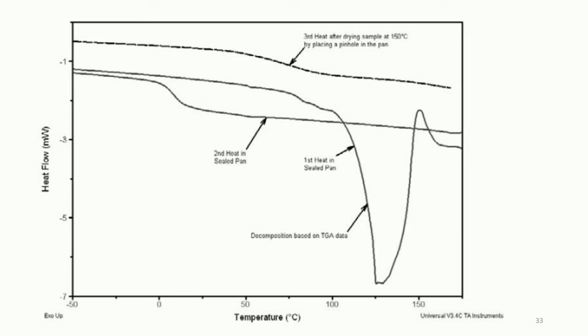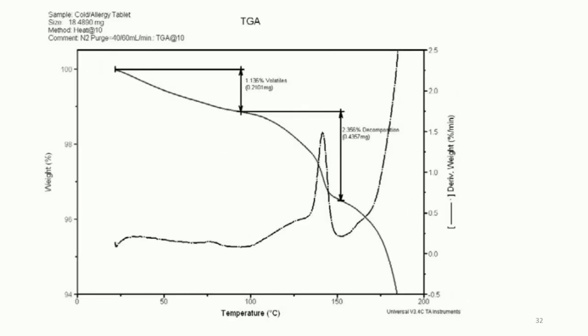The first one had more emphasis on the thermogravimetric analysis. We know that thermogravimetric analysis is the measurement of the mass change with reference to the temperature. In thermogravimetric analysis, we usually observe the mass change with respect to the temperature.